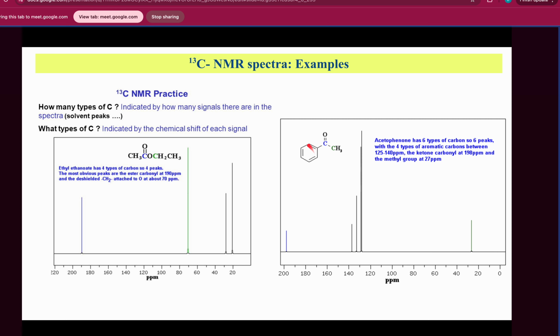Then comes these ortho carbons on these ortho positions. Both of these carbons have similar groups attached on both sides, so they will give only a single peak. Similarly, these other two carbons are also attached to identical groups on both sides, so they will also give only one single peak. And then this terminal carbon will give a unique peak.